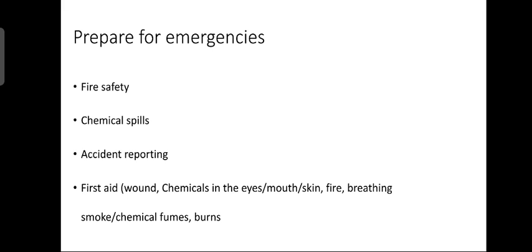Because of the health effects of mercury, extremely difficult and time consuming procedures are required to properly clean spills. Every effort should be taken to prevent accidents involving mercury. Always wash hands after handling mercury to prevent skin absorption or irritation. Always wear nitrile gloves while handling mercury. If mercury has been spilled on the floor, the workers involved in cleanup and decontamination should wear plastic shoe covers.